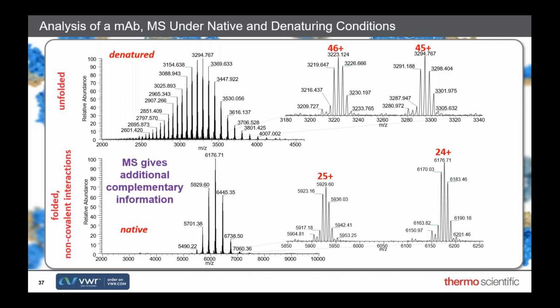But I guess the most significant takeaway from this slide is that both of these states give additional and complementary information about the structure of the protein. And in an ideal world, it would be best to use both denatured and native analysis.